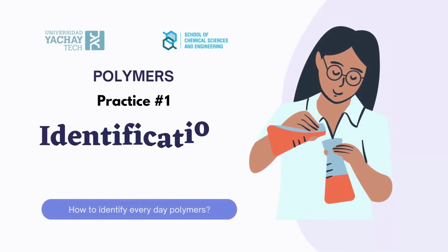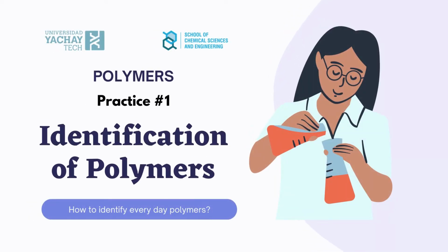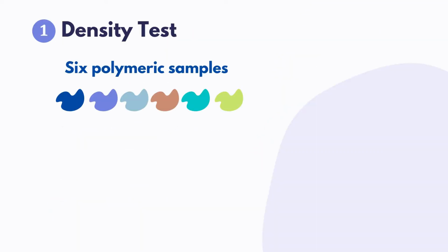Hello everybody, welcome to the first practice for Polymers course. Here we are going to learn how to identify polymer samples through two tests. Let's start with the density test.